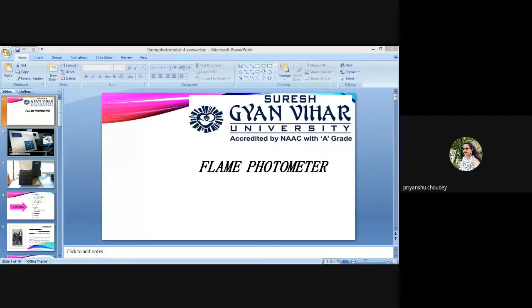Today we are going to talk about the flame photometer, the flame emission spectrophotometer, their principles, types of flame photometers, how to handle it, operation of a flame photometer, advantages of the instrument, and precautions also. So let's see what is a flame photometer.